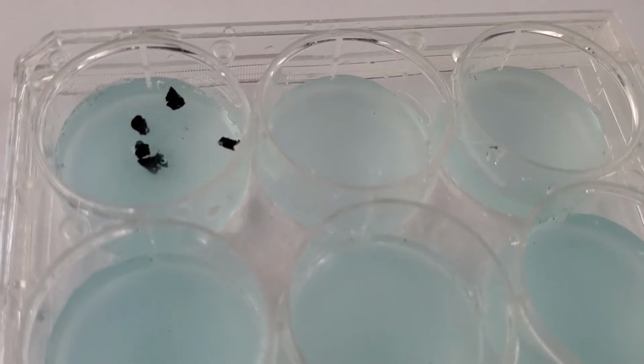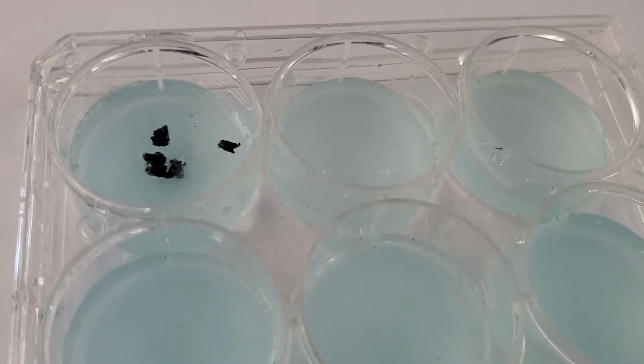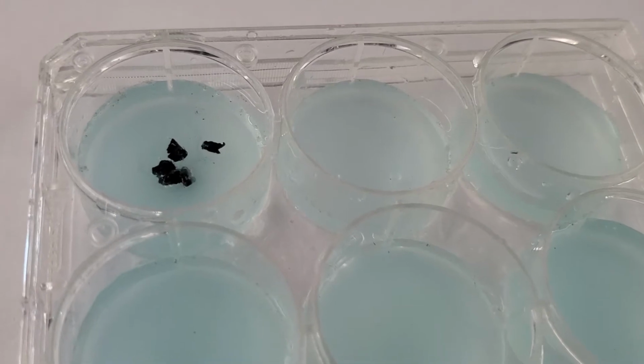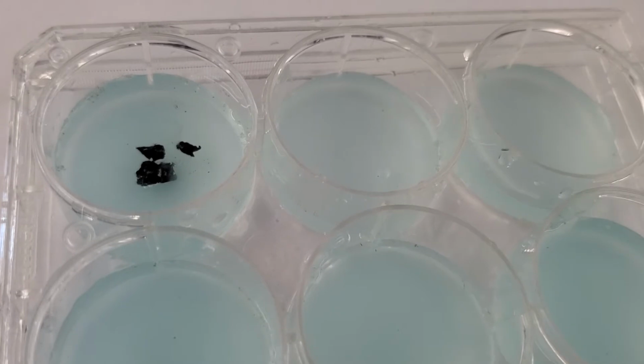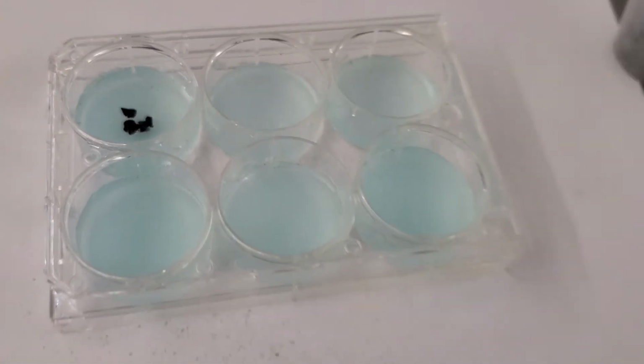They are floating a little bit, but you want to see if they change color or if they do a lot of bubbling. There'll be a little bit of bubbling because of what's coating the outside of the carbon, but that'll change.